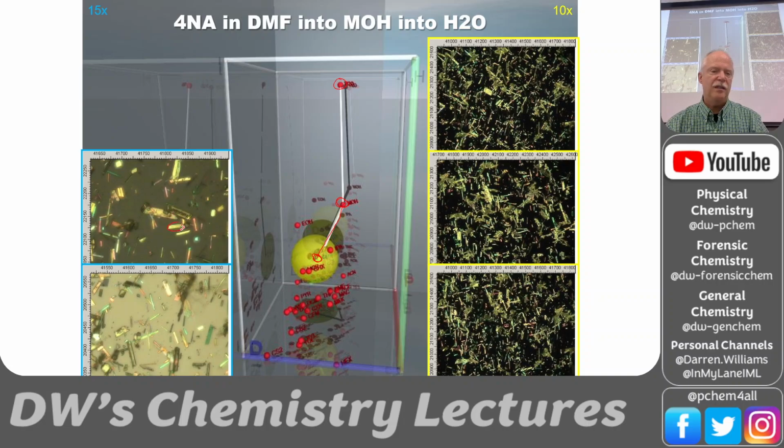We've got nice needles, some pretty large needles. You see very pure colors, which means that the crystals are crystalline. They're not irregular. They're not amorphous. So we're getting much more crystallinity, which means we're getting more perfect growth. So that growth mechanism is happening slower in methanol, and we're probably stabilizing certain faces in that crystal.